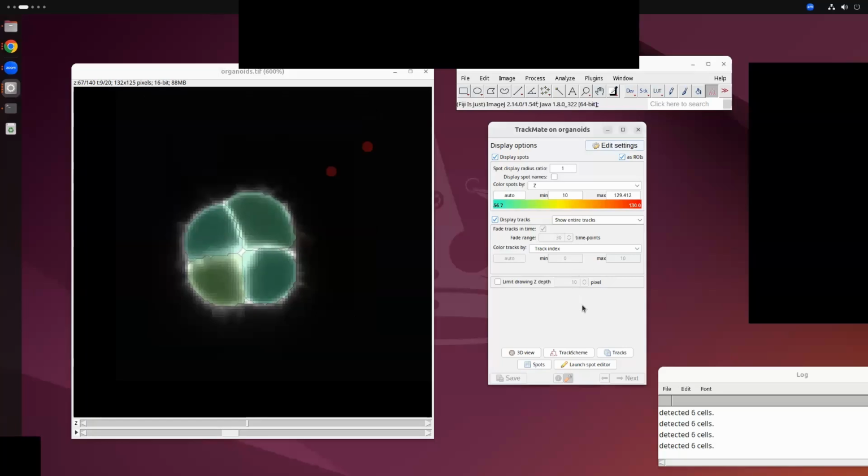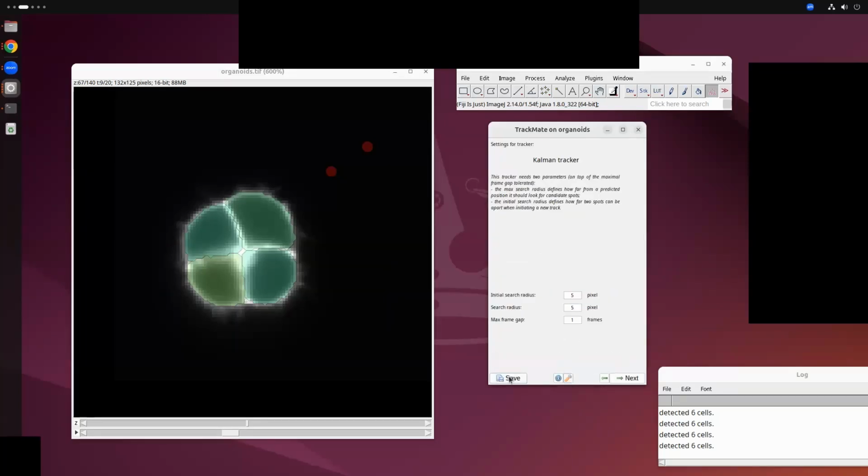And in the end, if you have worked with TrackMate, you would know that typically you export your data through save, and you export everything out into an XML file. All right, so this is our short session for today. And I guess I'm open for questions.